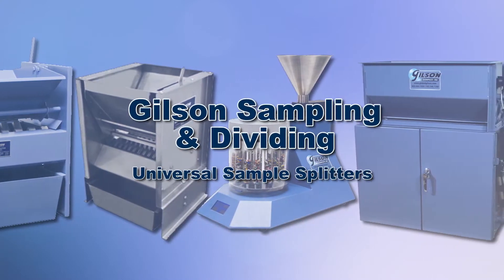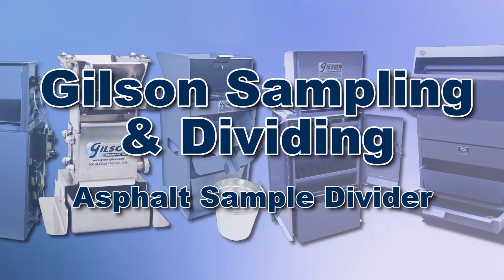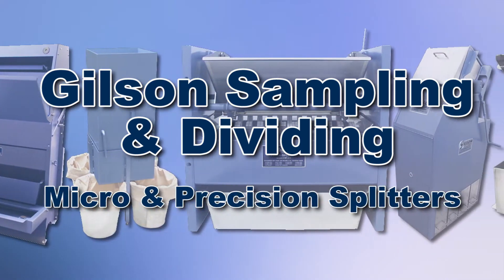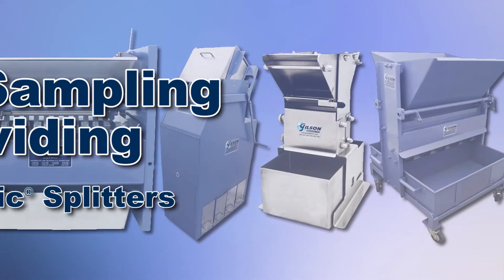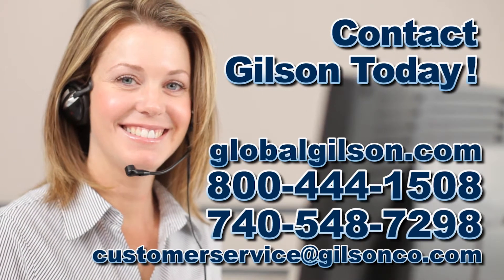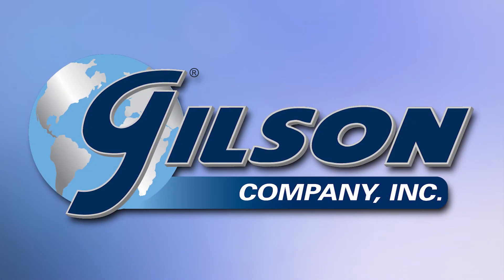Gilson offers these and many other sample splitters and dividers with a wide range of performance, features, and capacities for fast, accurate, and reliable sample dividing. Be sure to check out all our products listed in the Gilson catalog and on the Gilson website. Gilson — your industry leader in material testing equipment.